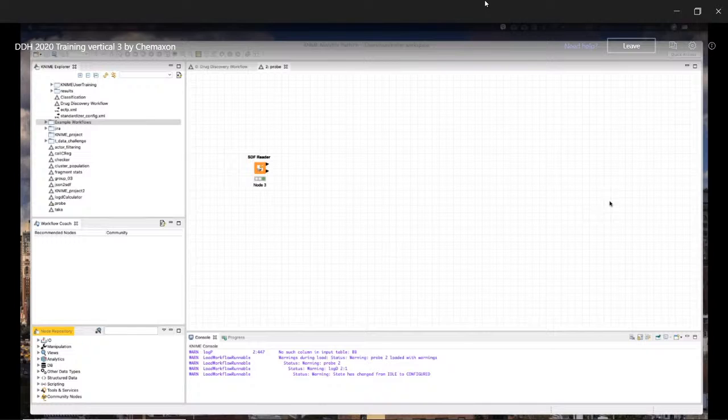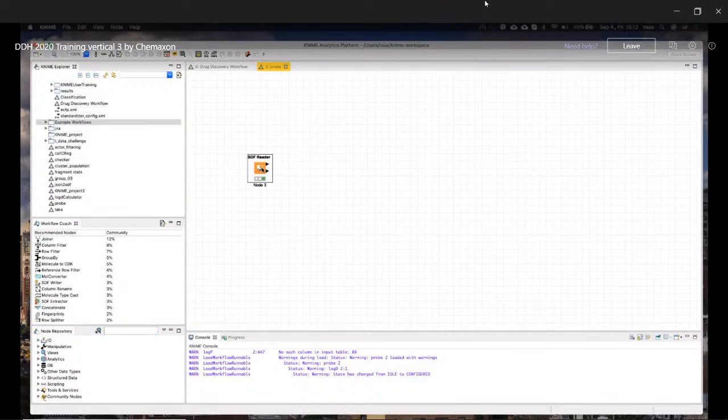So, first of all, let me just present you a little bit the KNIME, the tool that we are going to use today, which Dora already presented, and which is basically a very good and very intuitive workflow tool. The way it works is that you have your projects on the left-hand side panel, and you have a canvas where you write your little program and workflows. Here you can drop so-called nodes. And if you connect these nodes, you can run them, and there is going to be a data connection or data flow between these nodes. So basically, you can meaningfully process data with this.